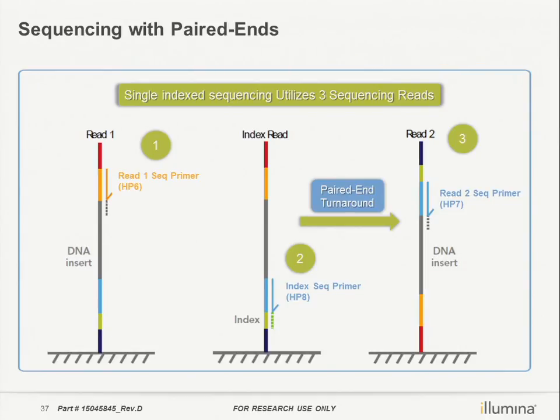So now we have the read one reads, and then we have the index sequence that was read.